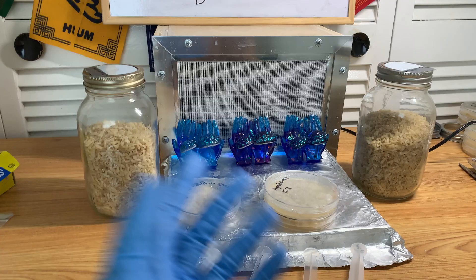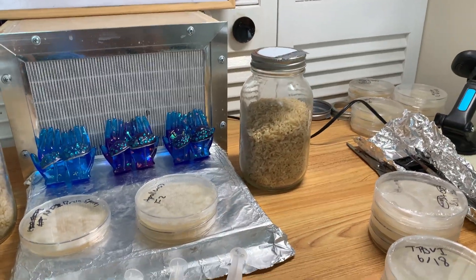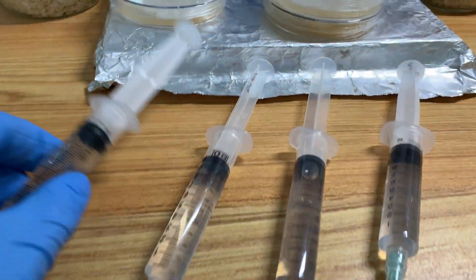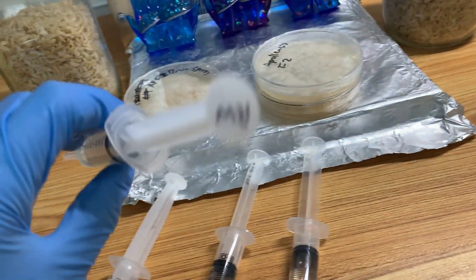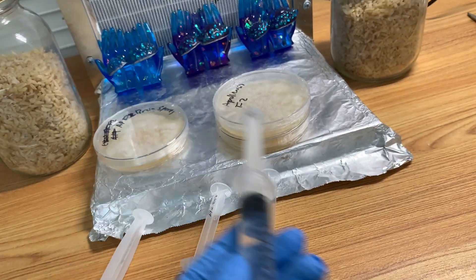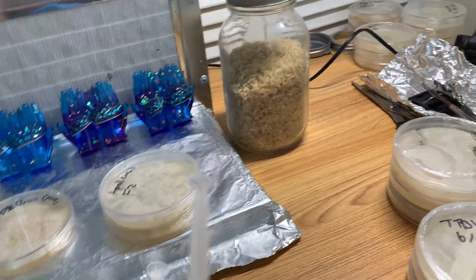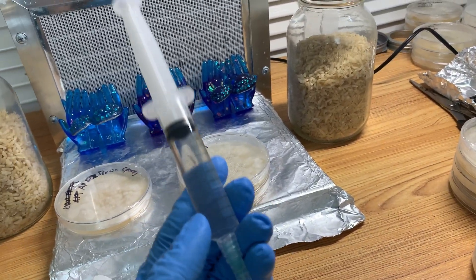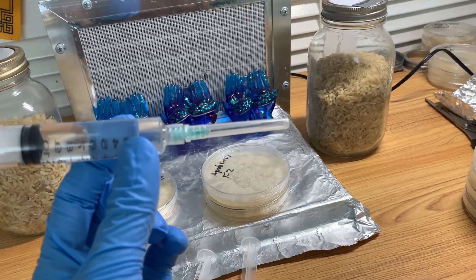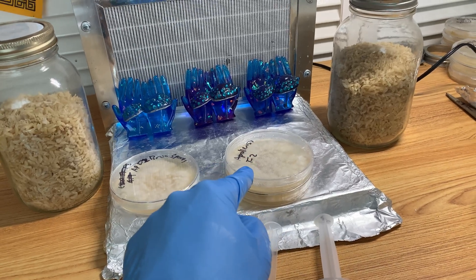I'd like to illustrate why that is. With spore syringes, I have a bunch here from different vendors. This one I personally made for my own use. You might wonder why I use spore syringes instead of agar. Basically, if I know my spores are clean and my sterile technique is good, I've never had any issue going from spore syringe directly to grain.